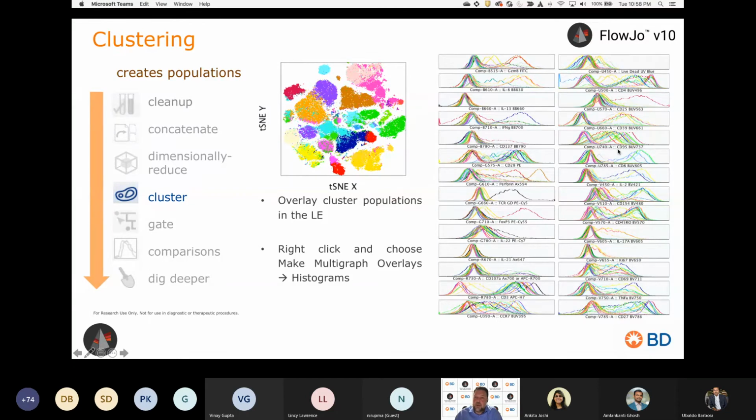And the point I want to make here is that with this type of complexity, when you have a continuous smear of a continuous population and not distinct bimodal subsets, manually gating for positivity doesn't necessarily do the complexity justice. We know that these markers are going up and down as part of an immune response.